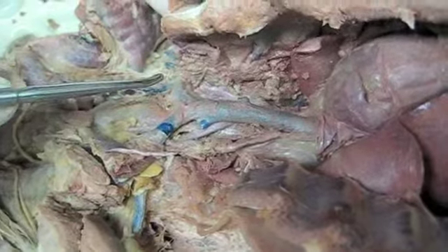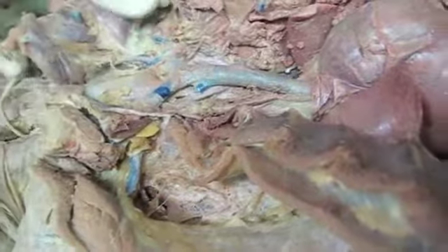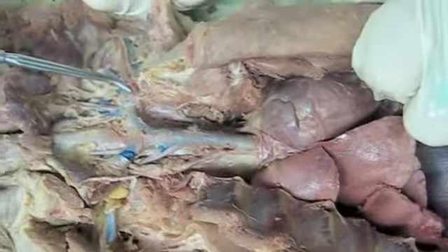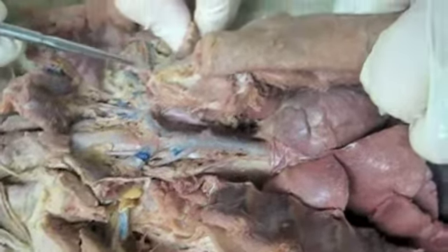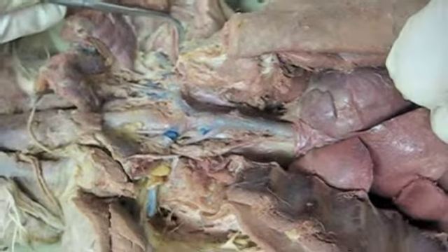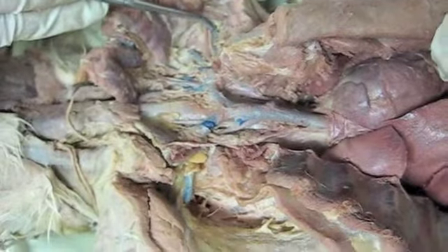So then the other branch that's coming off here and going out into the arm is this one. Initially when it comes off, it is the subclavian vein. Then when it gets out into the middle of the arm, it is the axillary vein. And then when it gets way out here into the arm, it is the brachial vein. So subclavian, axillary in the middle, brachial out here.